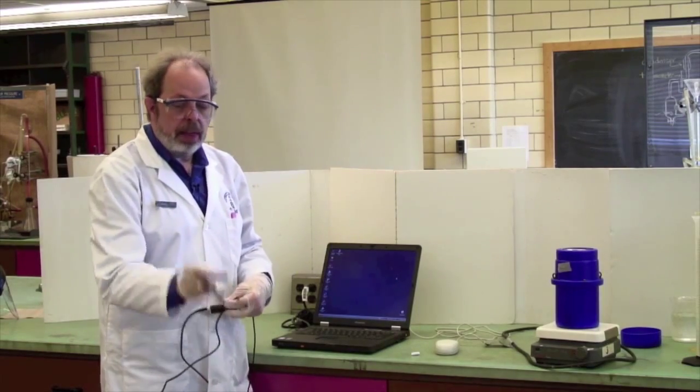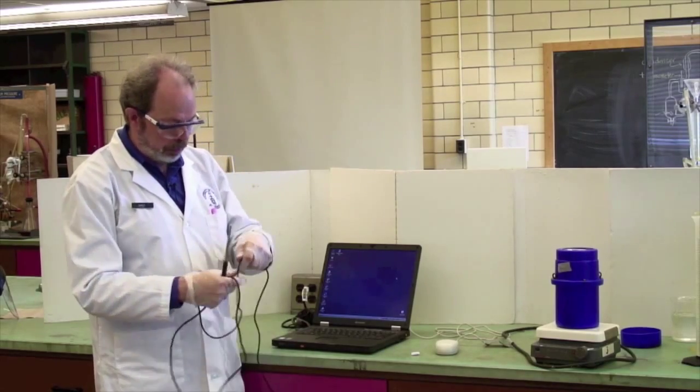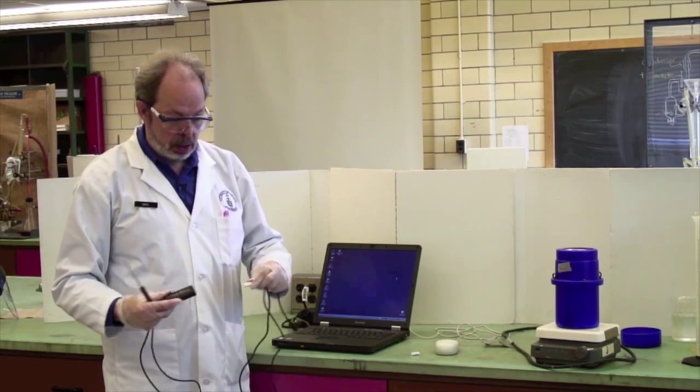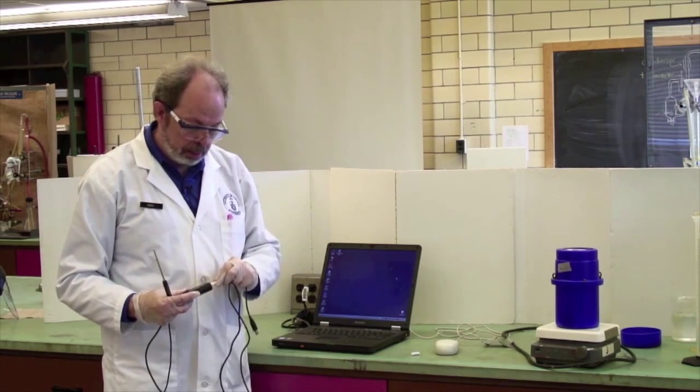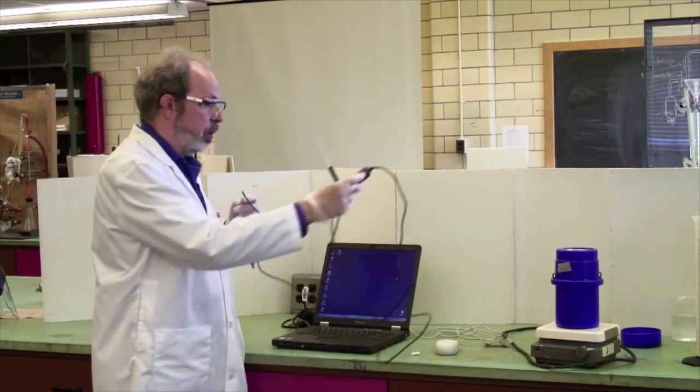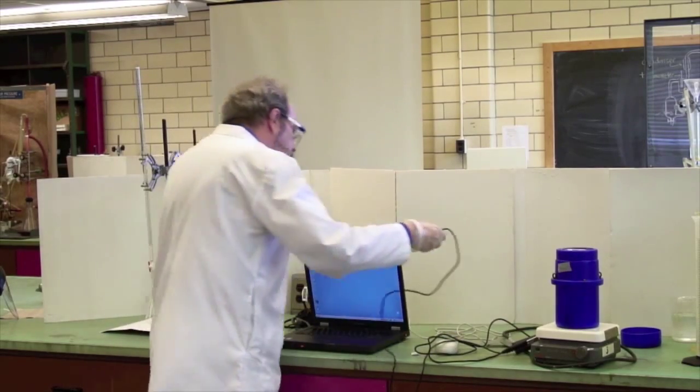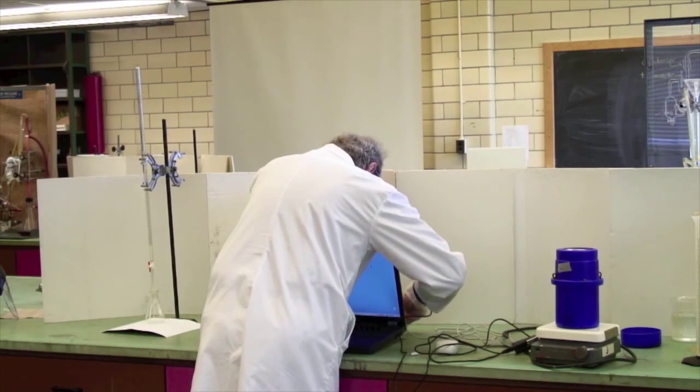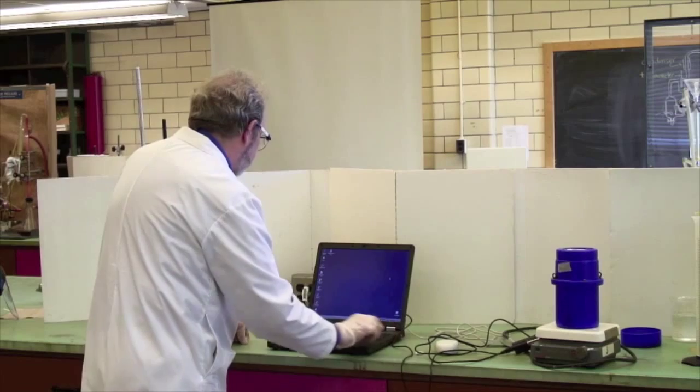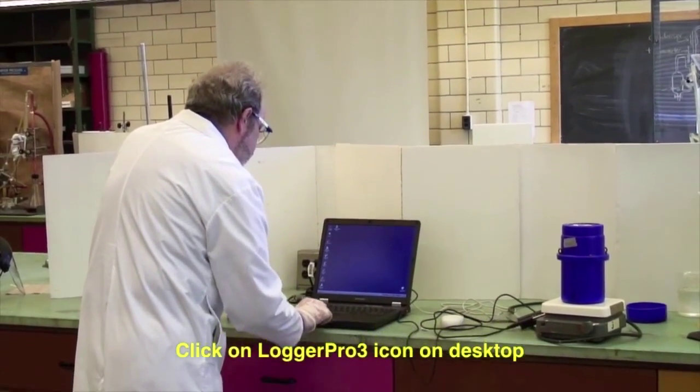This is a thermocouple which will be placed inside the calorimeter. And it goes through this box, which is technically called a Go-Link, which disconnects there. And we have here a USB port key, which actually fits in the back of the laptop. There we go. It's now recognized. And you are looking for Logger Pro 3.6.